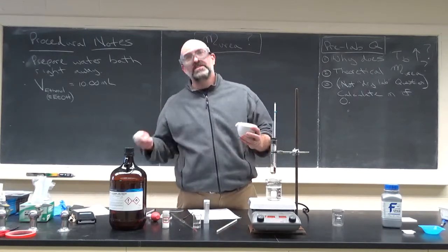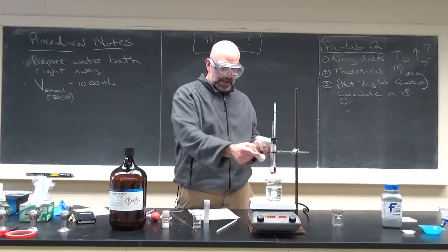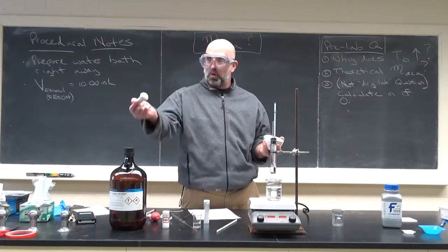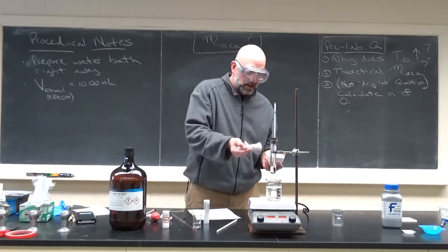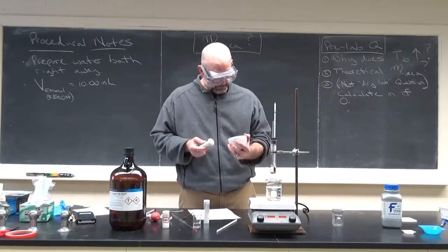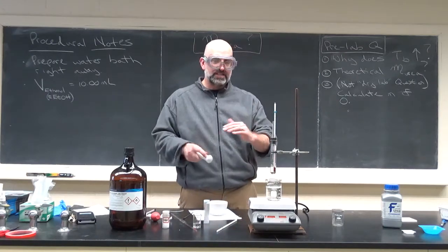Now, observations. Look at it. Describe what it looks like. Describe what the ethanol looks like. Ethanol should be a clear, colorless liquid. If you pour it out of your container and it has a yellow tint to it, something's wrong. So urea should be a pure white crystalline solid. Looks good to me, but always write that stuff down, even though your procedure doesn't always tell you to do it.